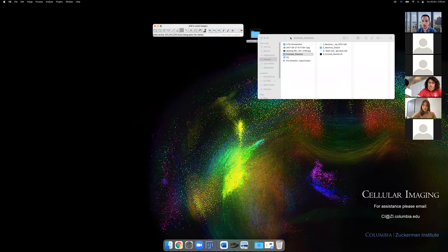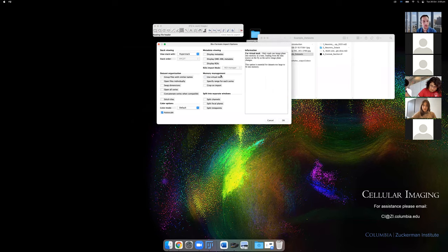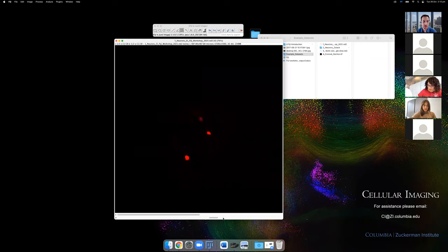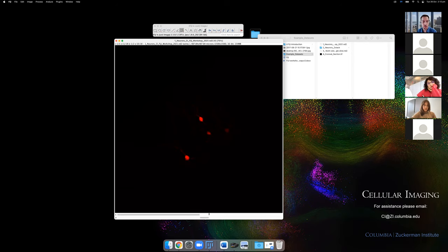Another thing with ND2 files and TIFF stacks — you can use a virtual stack to import data very quickly. You can see how much faster this opens compared to loading it completely. It's a little bit slower to interact with, but if this was a 20-gigabyte file I could still open it just as fast and then explore it, which is really nice for just exploring data on your laptop or showing someone in a lab meeting.